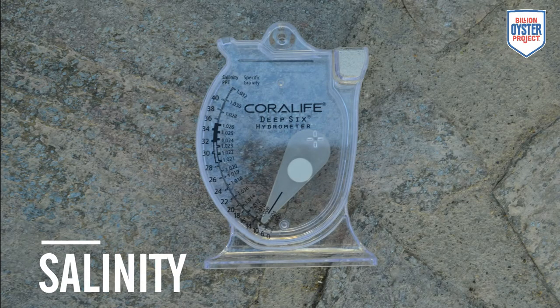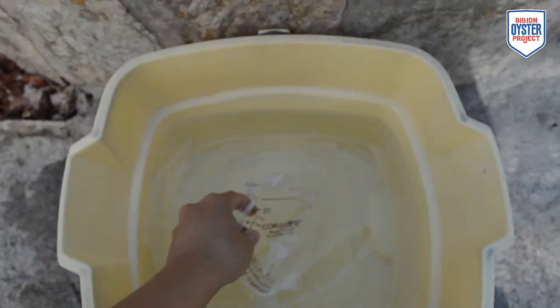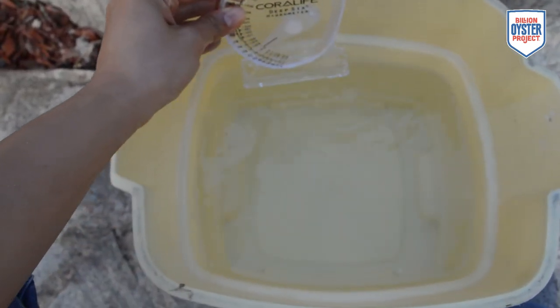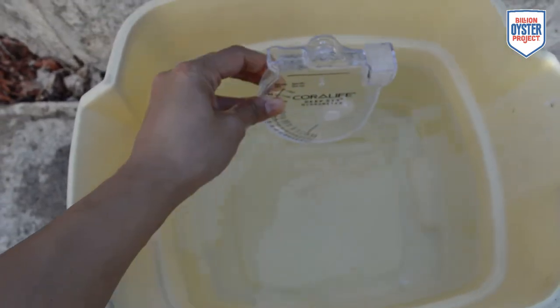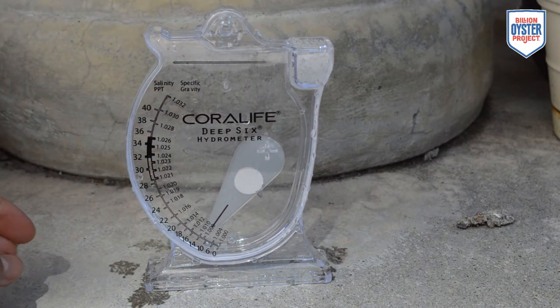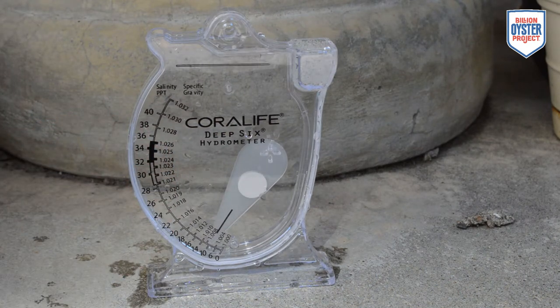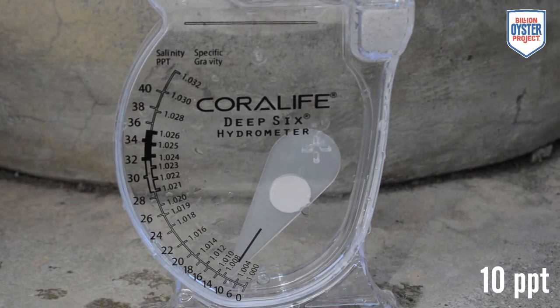To measure salinity, we will be using a hydrometer. Take the hydrometer and submerge it in the water. Make sure to fill the hydrometer up to the skinny part of the neck. Place the hydrometer on a flat surface. Tap the hydrometer down gently to release any air bubbles that may affect the reading. Come down to eye level with the hydrometer and read the position of the plastic pointer in parts per thousand. Record your observation.